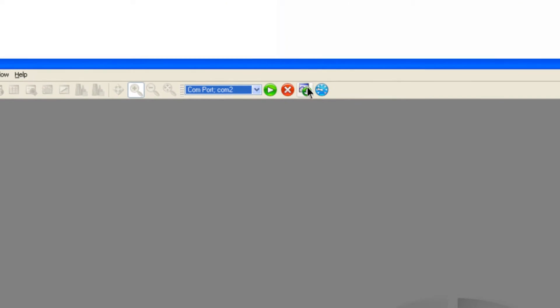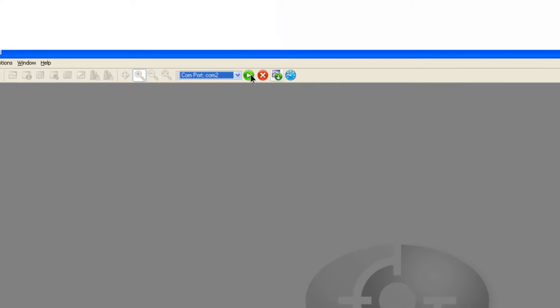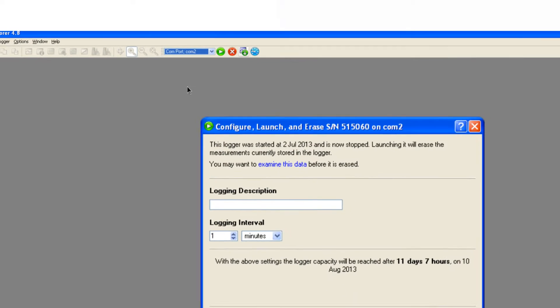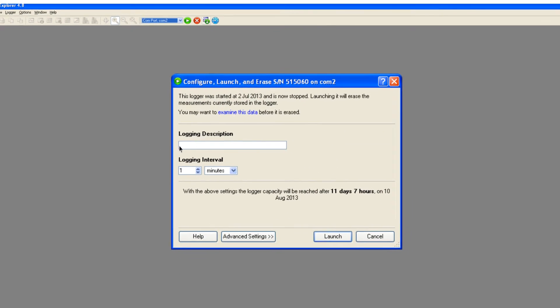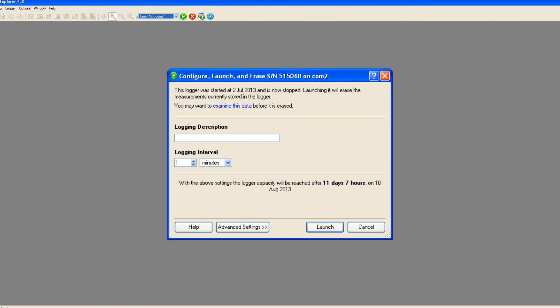The logger is now ready to set up. Click on the launch icon. The first time you start the logger, you will see a basic settings view. Here you can enter a description for your logging run and set the logging interval, that is, the time between each reading.